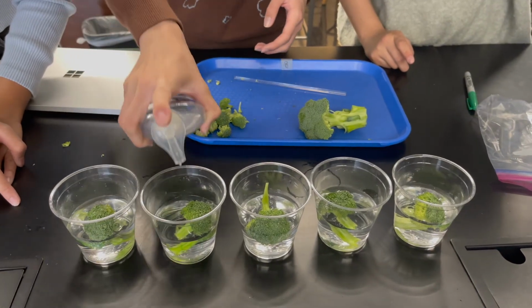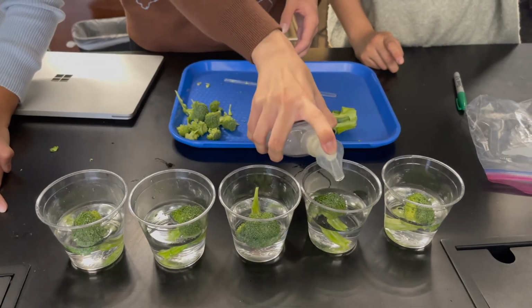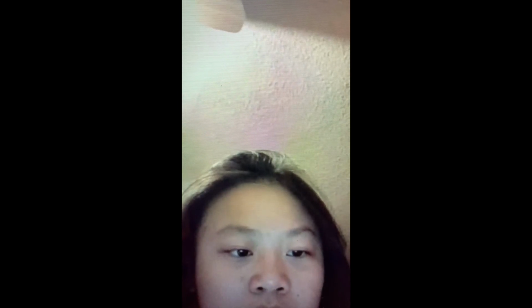Controllable drop size of the soap being squirted into the cup. The size of the soap droplet depends solely on the exertion of forces onto the bottle, and as the stirring rod was used to evenly distribute the solution, more bubbles were formed. Therefore, it would cause the recording of data to be inaccurate.